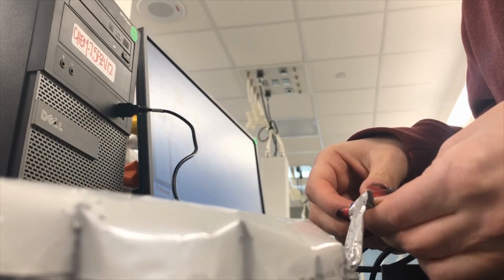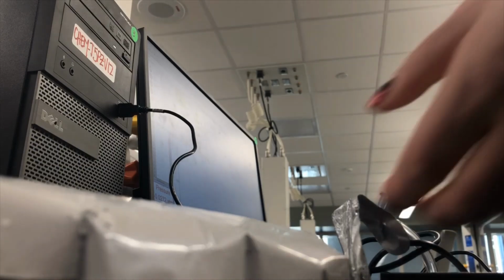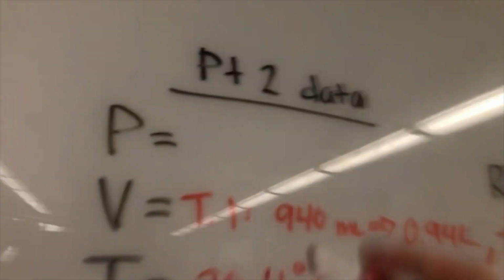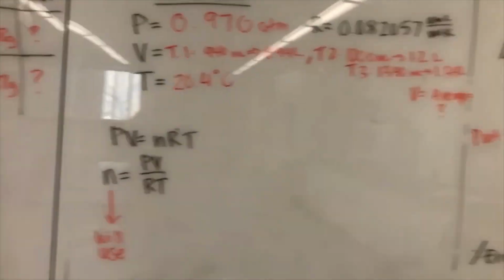Okay, so the pressure that we're getting from that is 0.970 ATM.